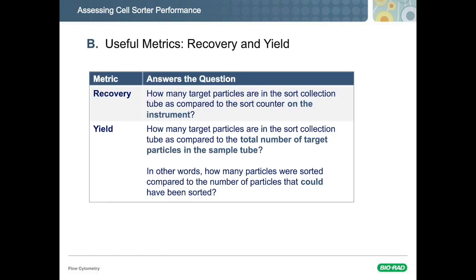And we've been using some of these terms, and so we wanted to get them in and define them well. All of these terms, recovery, yield, efficiency, have their own little nuances depending on who's talking about them, where they're being talked about, and which company it is. And it makes it a little tricky out in the field.